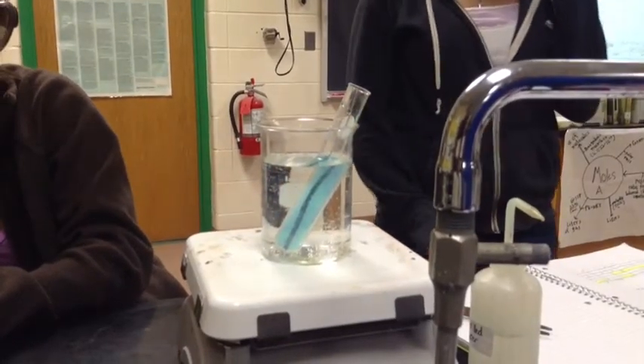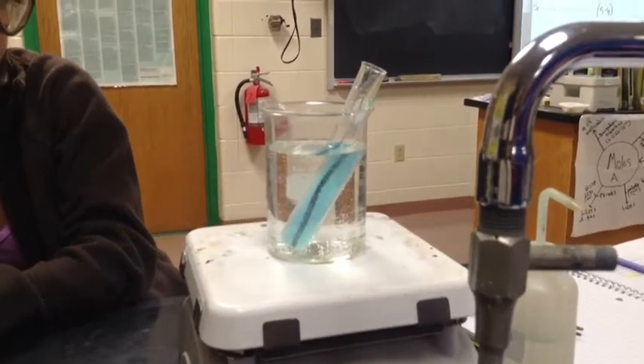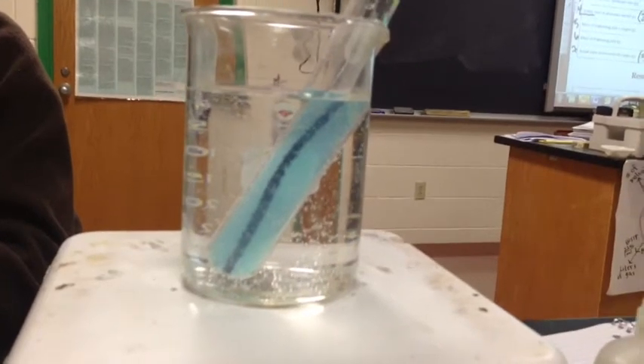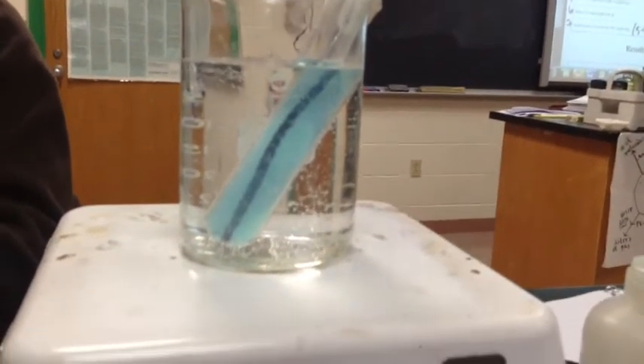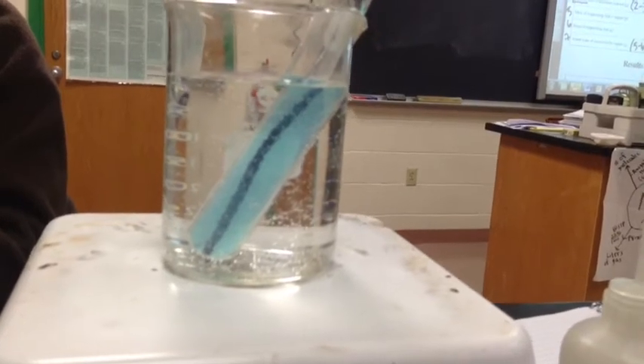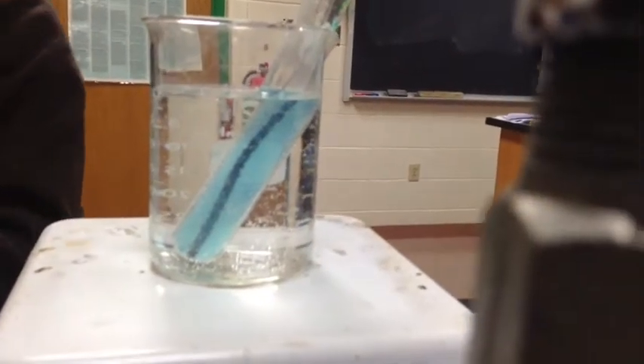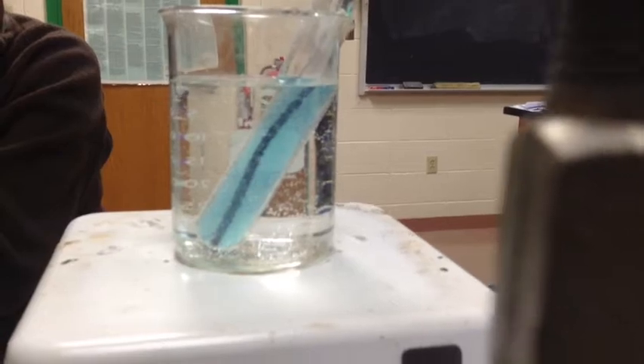You put the aluminum wire in there. And you can start to see that the copper metal is forming on the aluminum wire. That nice pretty blue color of the copper two chloride is getting lighter and lighter. We're going to know that it's gone to completion once that blue color is totally gone. And then we'll measure the copper on the other end.